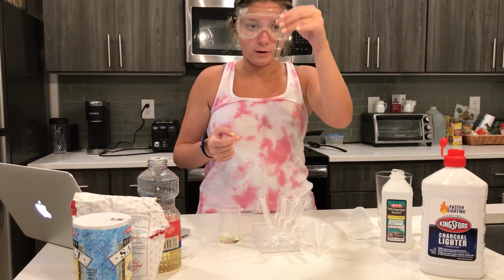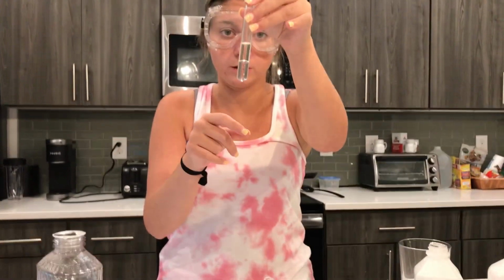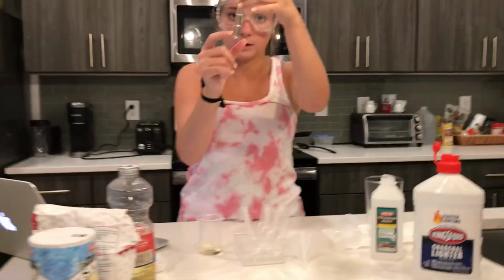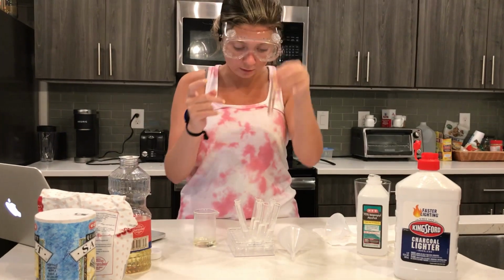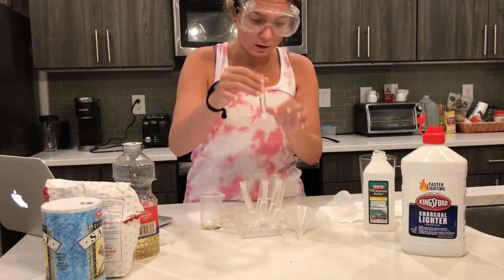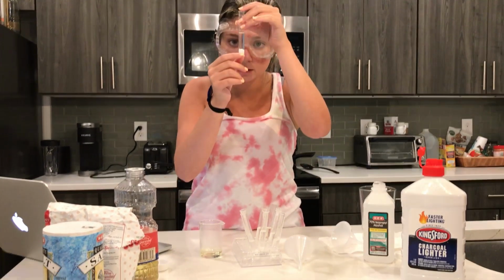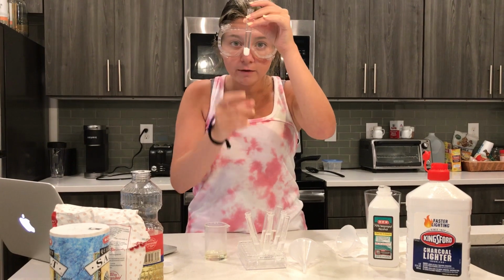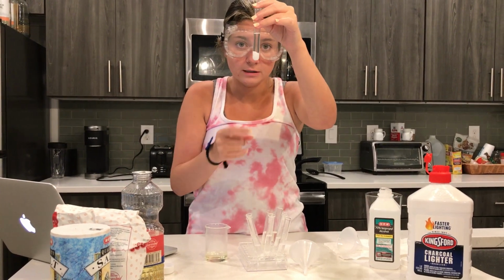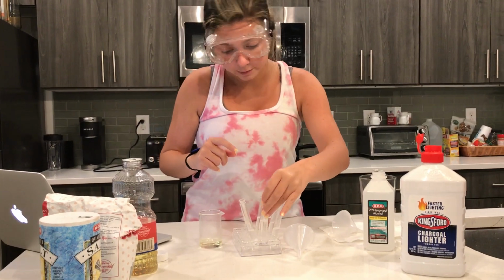And then lastly we have water and oil for this row, which, I mean, water and oil aren't known to mix, and so there is a clear line in the middle. And next we have salt and isopropyl alcohol, and so that looks like it's kind of dissolving a little bit, but there's clearly still a bunch of salt at the bottom, so not really mixed.